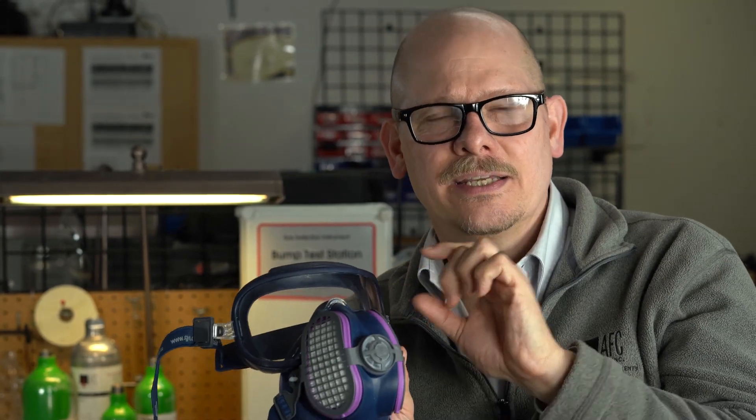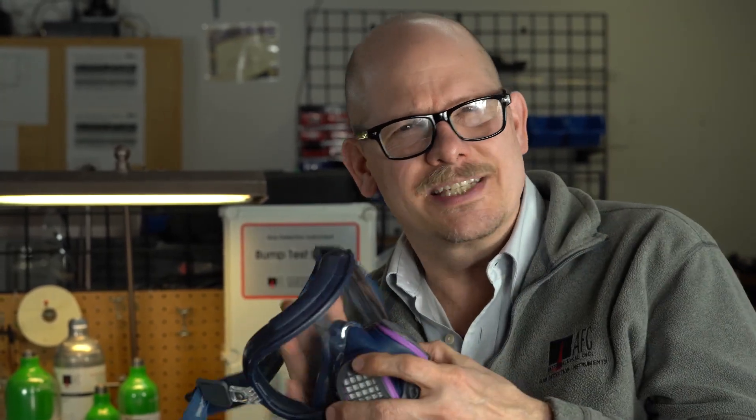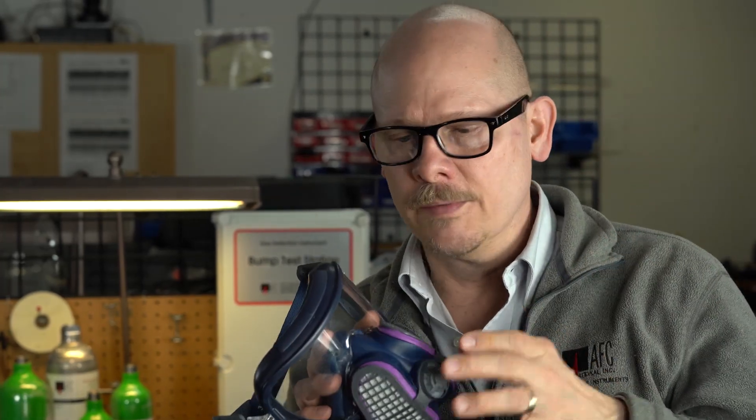This Integra is kind of neat. You notice I wear safety glasses and I wear regular glasses too. So if you have contacts, it's going to be perfect for you. Right now they do not have an optics kit yet — I've been told that's coming down the line maybe a couple of months from now. You'll actually have an optics kit you can put inside here if you absolutely have to use glasses. If not, you can use contacts because this is not like an SCBA or self-contained breathing apparatus. We're not creating positive pressure, so there'll be no risk for you to lose your contacts — just be like walking around normally.